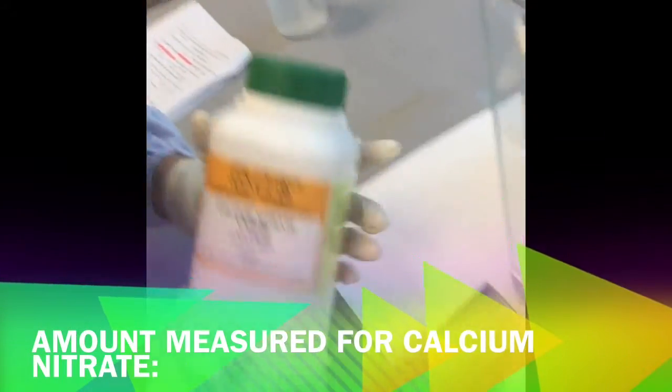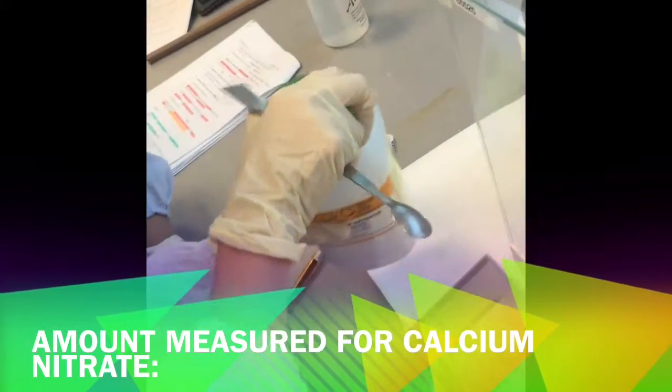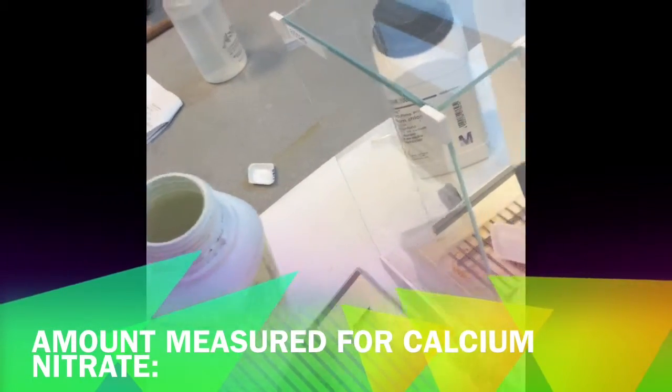Next, we are going to proceed with calcium nitrate. The amount that we are measuring today is 2.95 grams. After doing the measurement, please ensure that the weighing boat is labeled too.